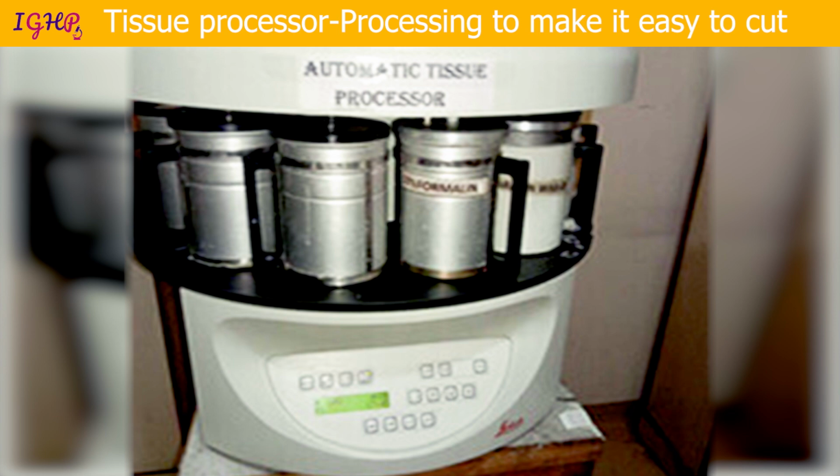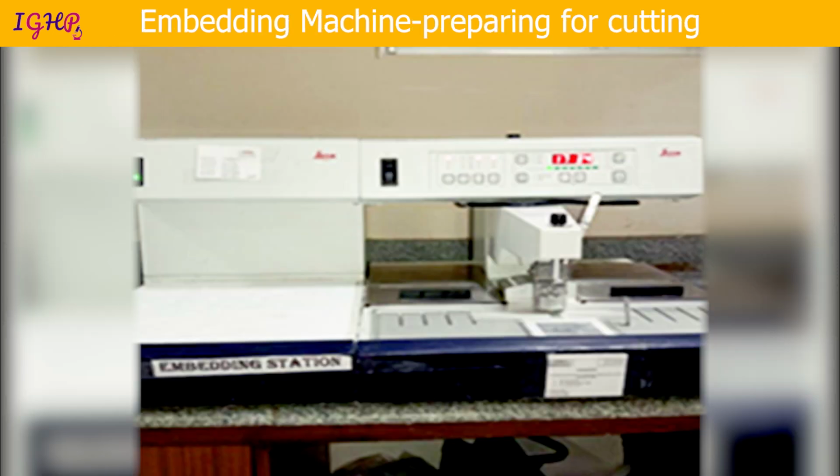Then after the alcohol, you dip the cassettes in xylene. And after xylene, the xylene is removed with the help of the wax. So the final idea is that whatever tissue we have grossed, we remove the water and get wax impregnated in the tissue so that it can be easily cut with the microtome. Now the next family member of Mr. M is the embedding machine, and this is the second step in the processing. In the embedding machine, as you can see here, there are 2 areas, one is the hot plate and one is the cold plate.